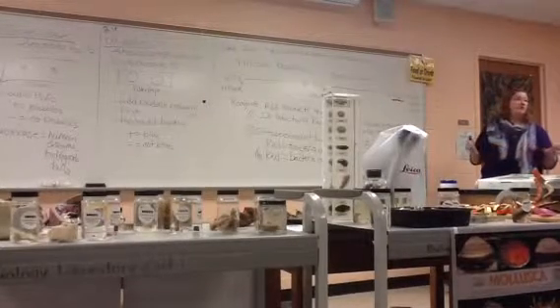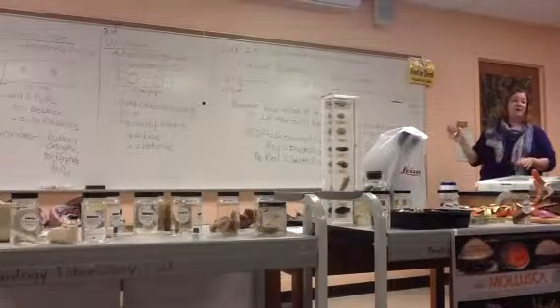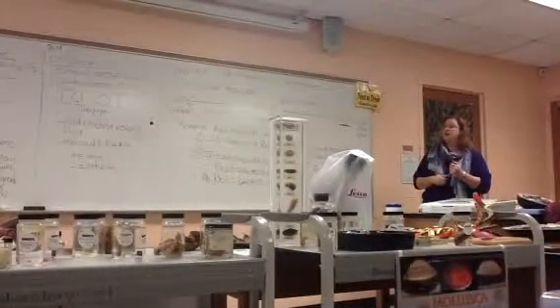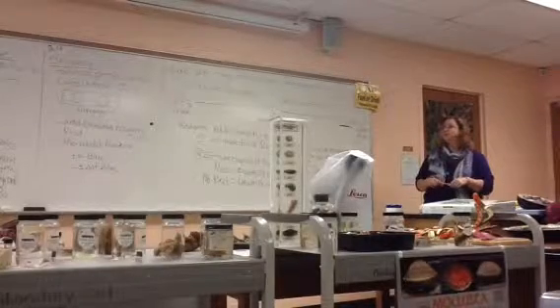All right, so today it's pretty easy. You're just inoculating the tubes. And Lab 25 has a bunch of bacteria listed. They're on Petri dishes here. Okay, so you're just going to be using your loop. This is a liquid media, so you can just use your loop, put the bacteria in.